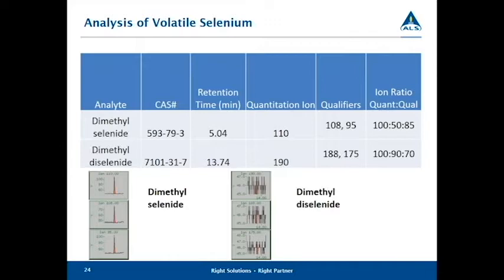And again, a recommendation would be maybe not to use a high density polyethylene container, but to use a glass container. Typically a glass purge and trap vial, which is similar to what we collect mercury samples in for a similar reason. So a glass purge and trap vial with 0 headspace, and then preserved with nitric, or transferred to the lab from a regular bottle, and frozen at the lab before analysis. It's the recommended way for you to analyze volatile selenium compounds.